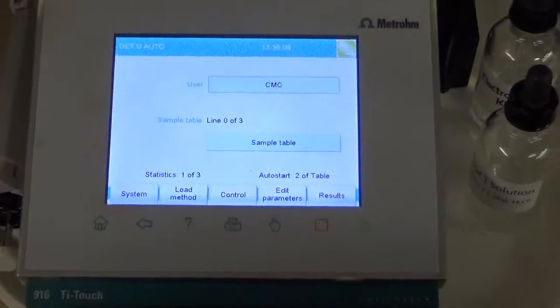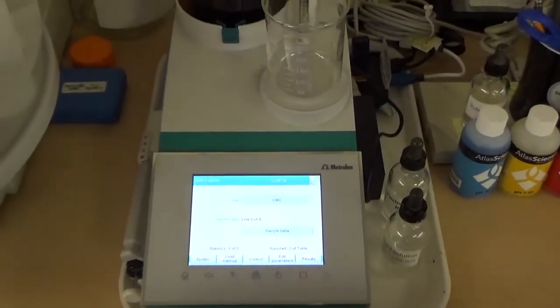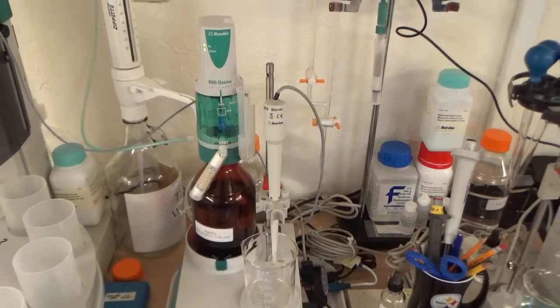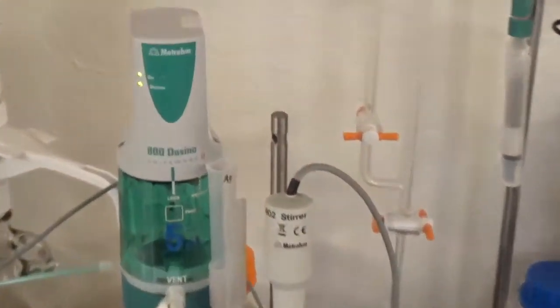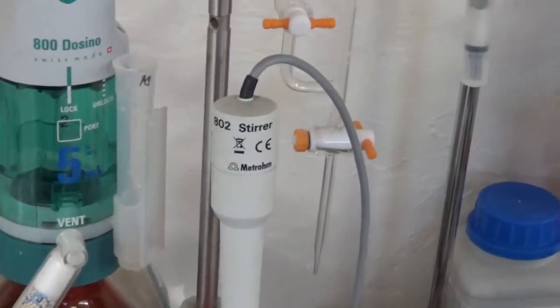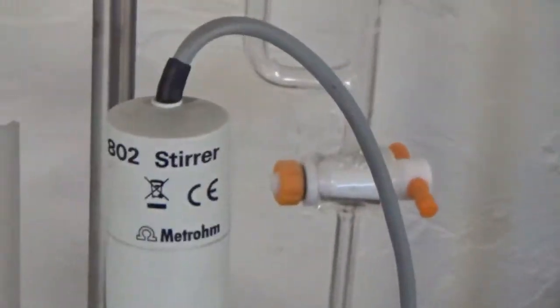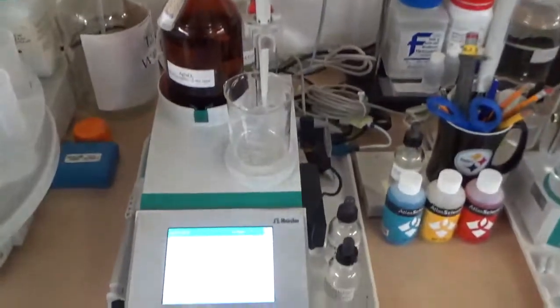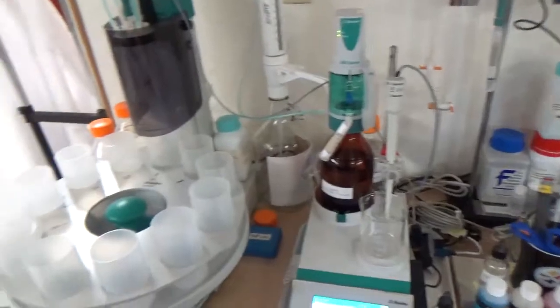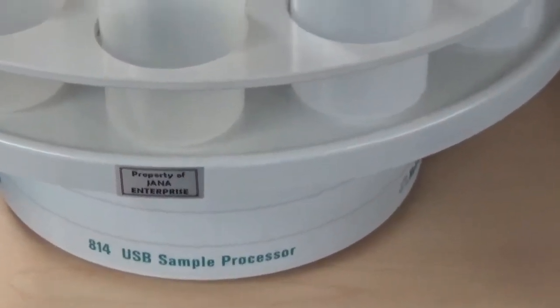Here is a setup using the Metrohm 916 Ti-Touch — a touch-control compact tabletop titrator. It comes with a Metrohm 800 Dosino to dose the silver nitrate, and an 802 rod stirrer instead of a conventional magnetic stirrer. The entire 916 Ti-Touch titrator is connected to a 814 USB sample processor, which comes with a rack containing 12 sample positions.